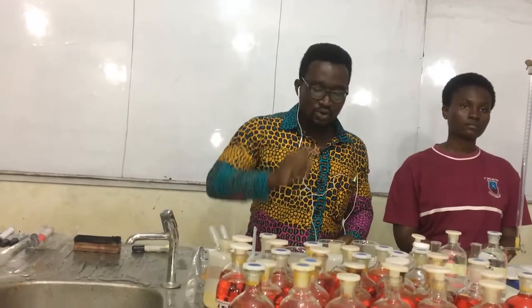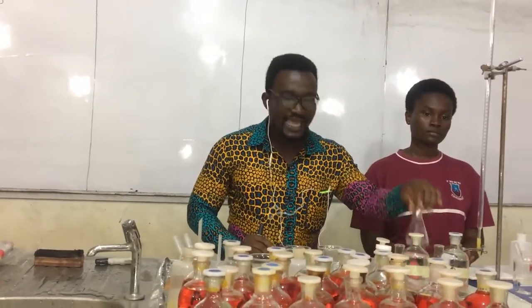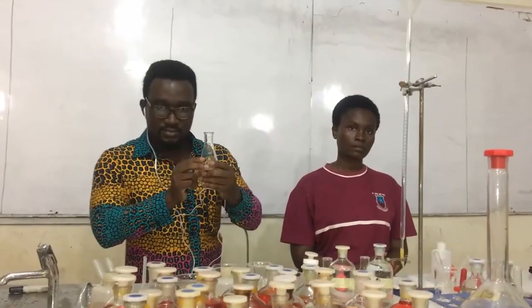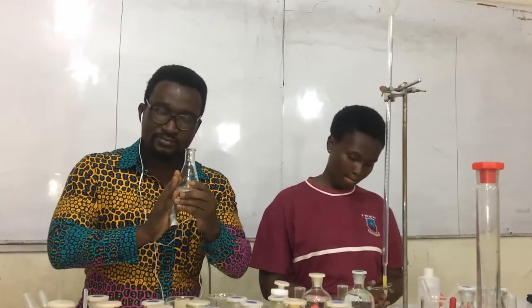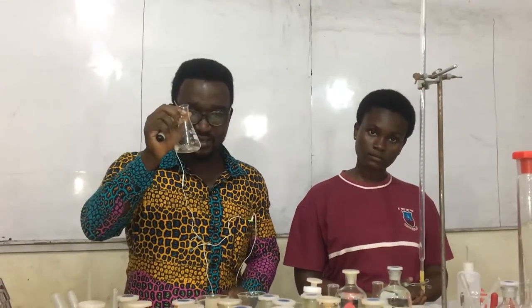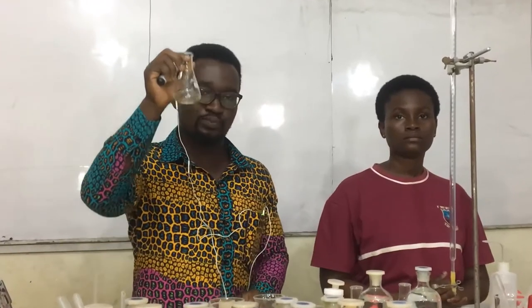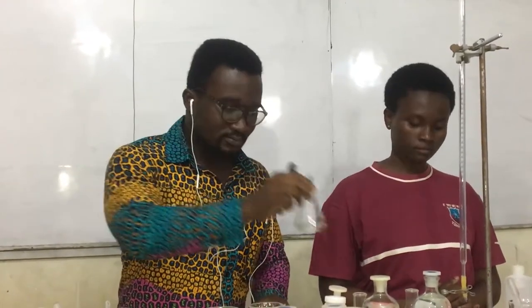The question is, why is it that we only rinsed the Erlenmeyer flask 3 times with tap water and 3 times with deionized water, but we did not rinse the Erlenmeyer flask with the solution B that we are supposed to put in here? That question goes to you. You can pause the video, then answer the question. You can also guess.